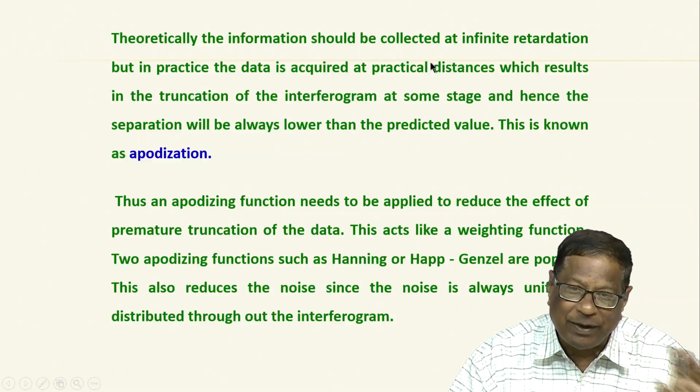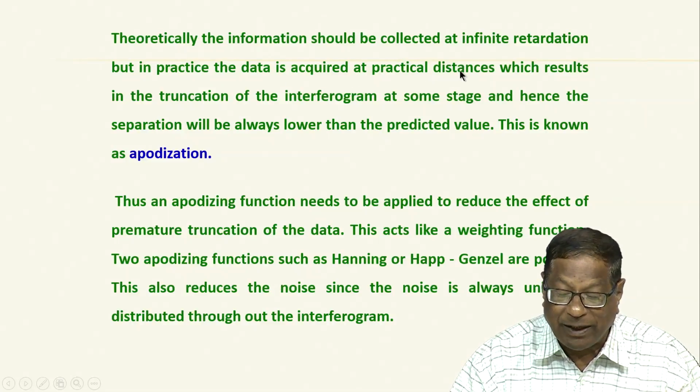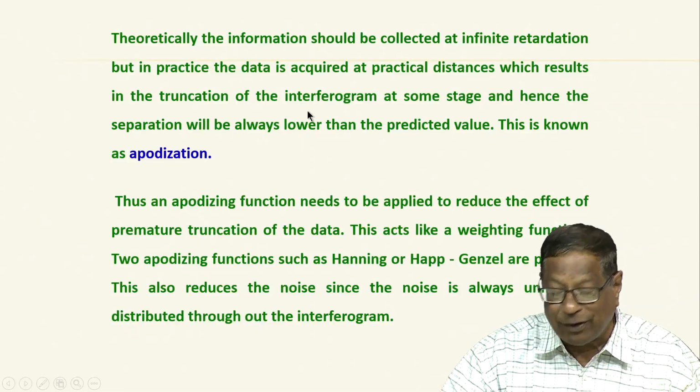So, I have certain restrictions, that is it is acquired at practical distances, which results in the truncation of the interferogram.